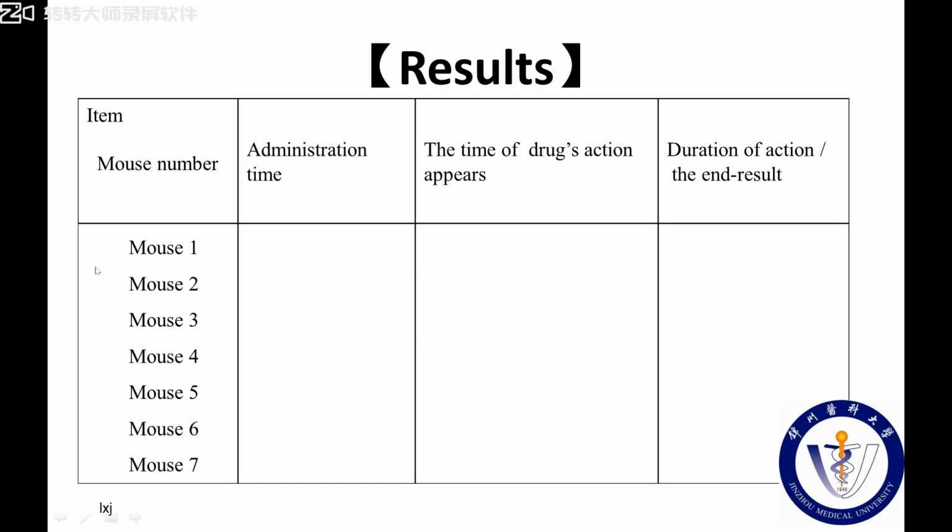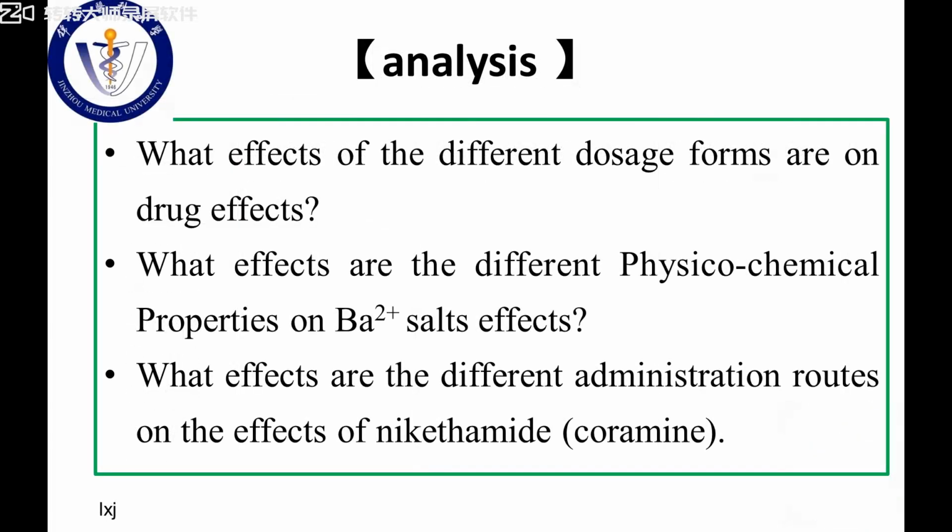Of course, you should fill the results into the table, and based on these questions, analyze, discuss and explain the results. Maybe during your experiment, some students or some groups cannot get the ideal experimental result. You should also analyze why.